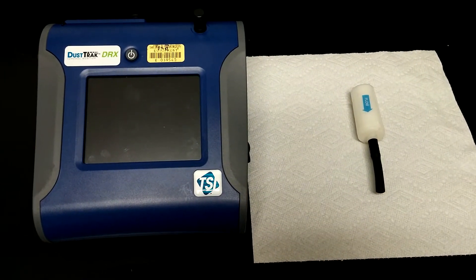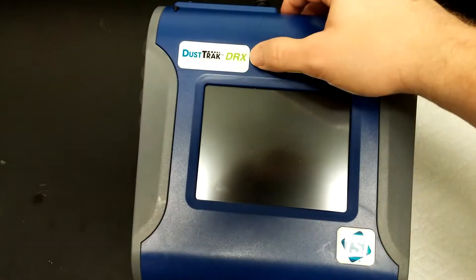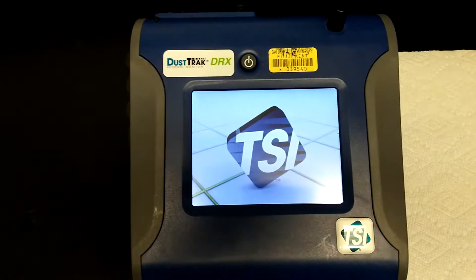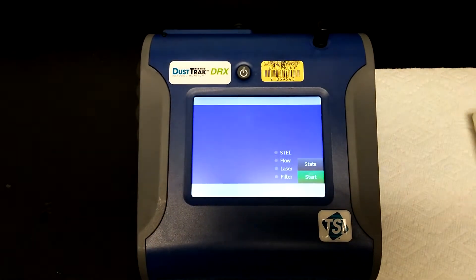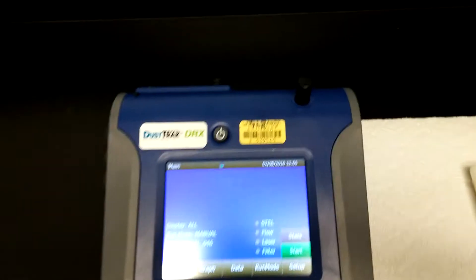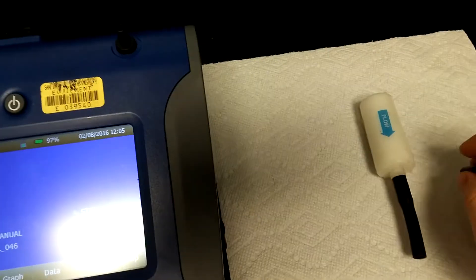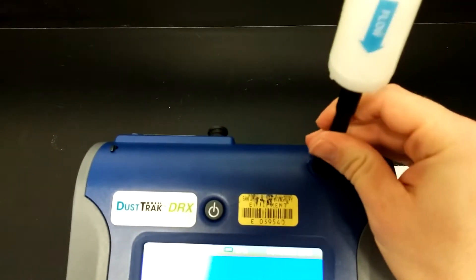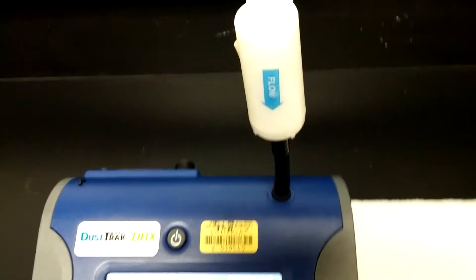The first step for the zero calibration of the DustTrak DRX is to turn it on by pressing the power button. Once the machine is powered on, go ahead and remove the inlet cap and attach the zero filter. Notice that the flow arrow is pointing towards the machine.